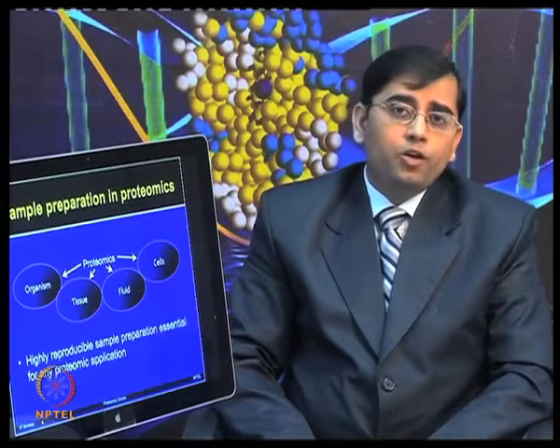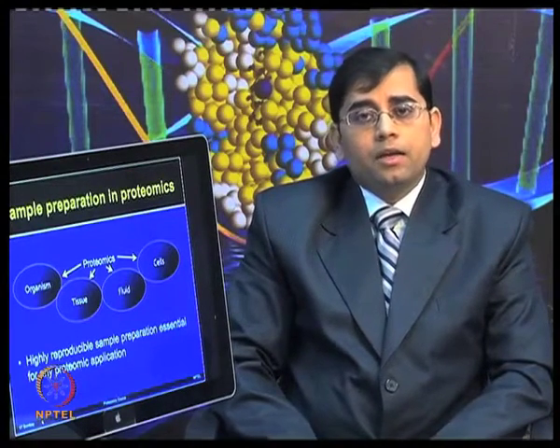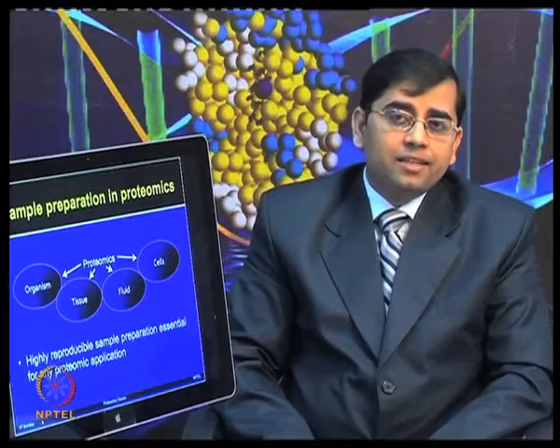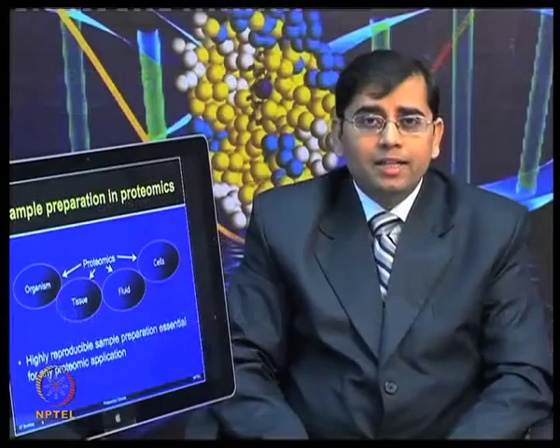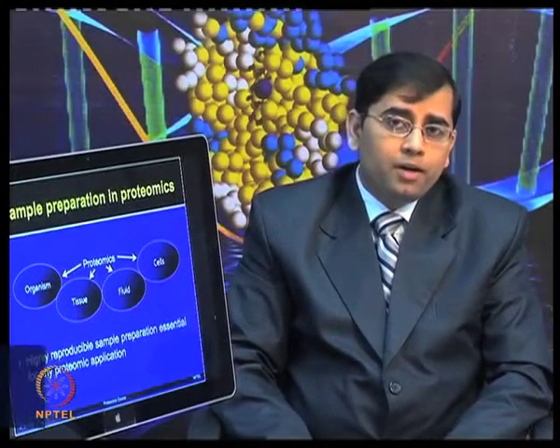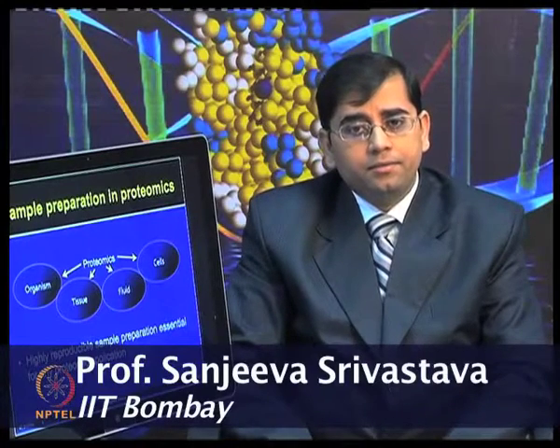Proteome is very complex. Whether you want to perform your proteomic analysis for the whole organism, it means you want to know all the proteins present in a given organism, or in a tissue, or in body fluids, or in different types of cells. Proteomics can be global, or it can be very targeted or expression based.